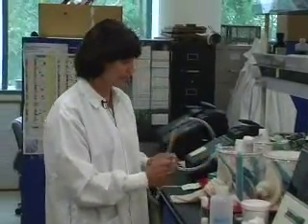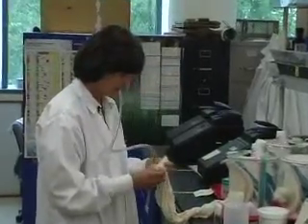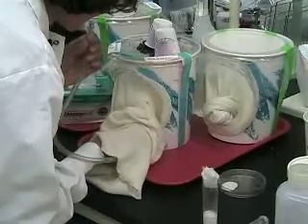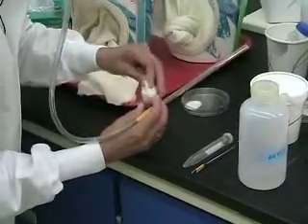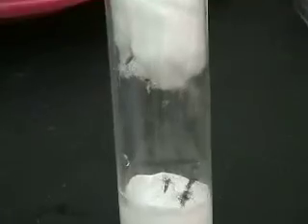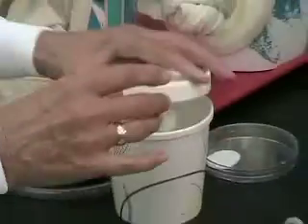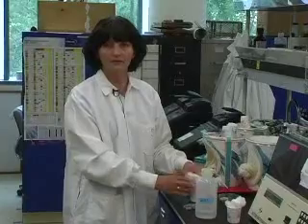Right now I am going to collect 6 to 10 females. I transfer females to the Drosophila vial and I am going to put them into dark conditions, and put in the chamber which has 27 degrees Celsius for 1 hour and 15 minutes.